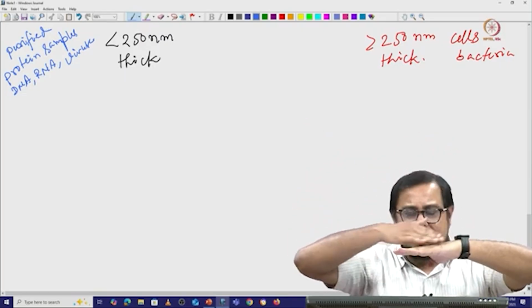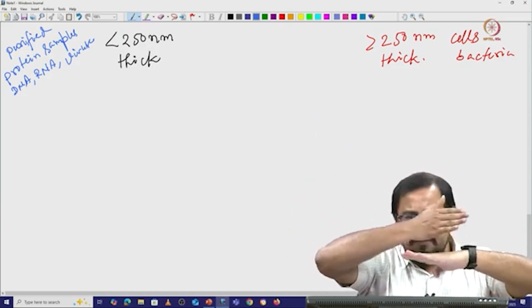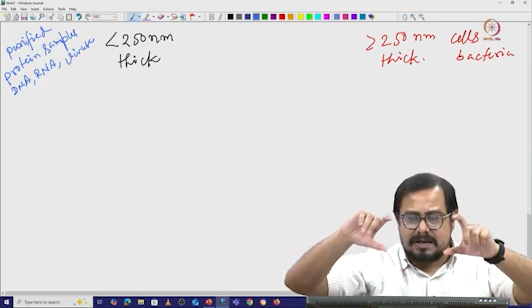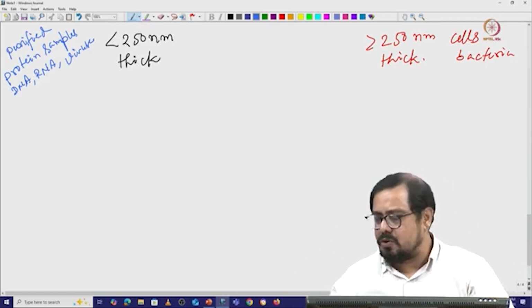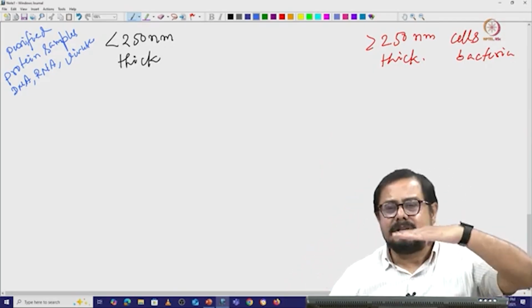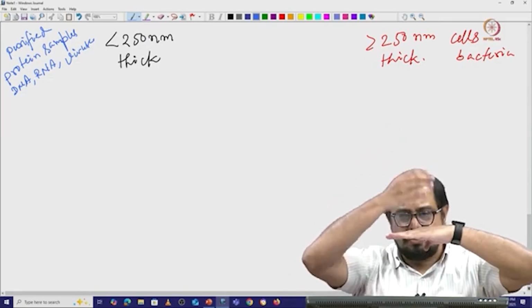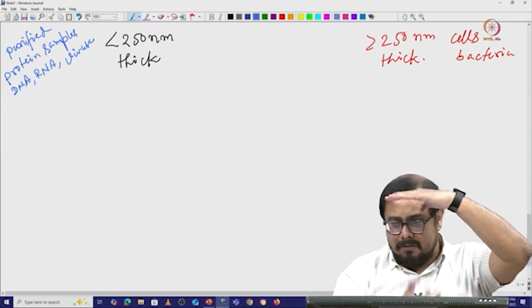So, we record the back scattered electrons or the secondary electrons, which hit, displace their position, and go out. But for transmission electron microscopy, the electron beam goes through the sample, and when it goes through, we are imaging.